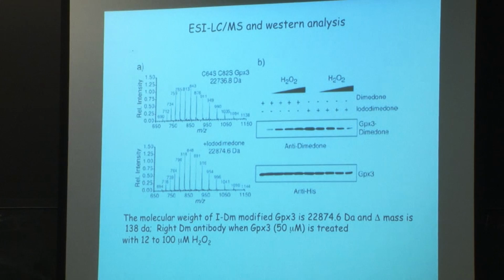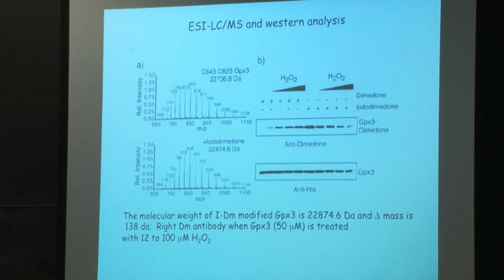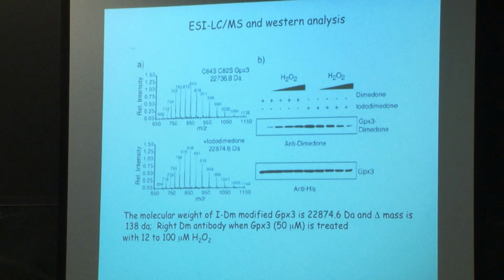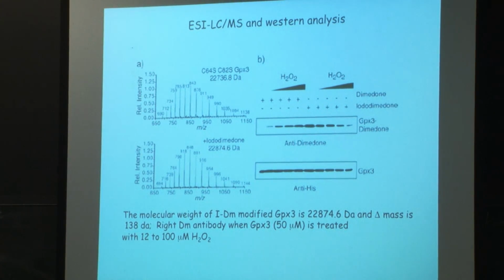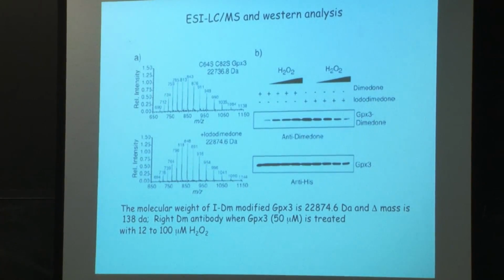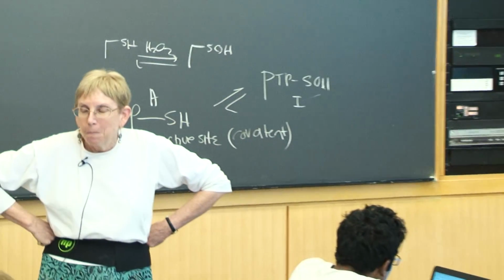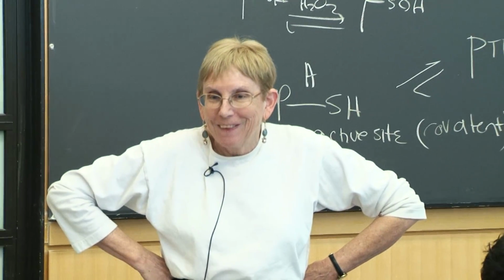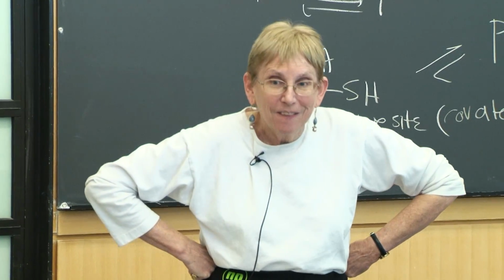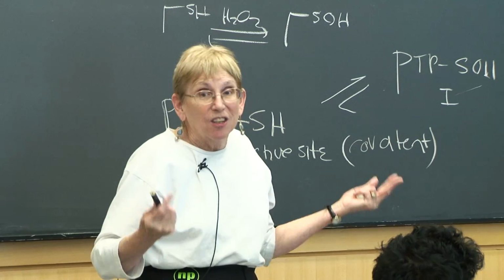So we have a glutathione peroxidase, which was also in the current paper. And what do we know about the glutathione peroxidase in this paper? If you read the paper, did this ring a bell from the previous paper? So what was unique about glutathione peroxidase? It has an active site cysteine. Yeah, it has an active site cysteine that they can use to validate the approach.